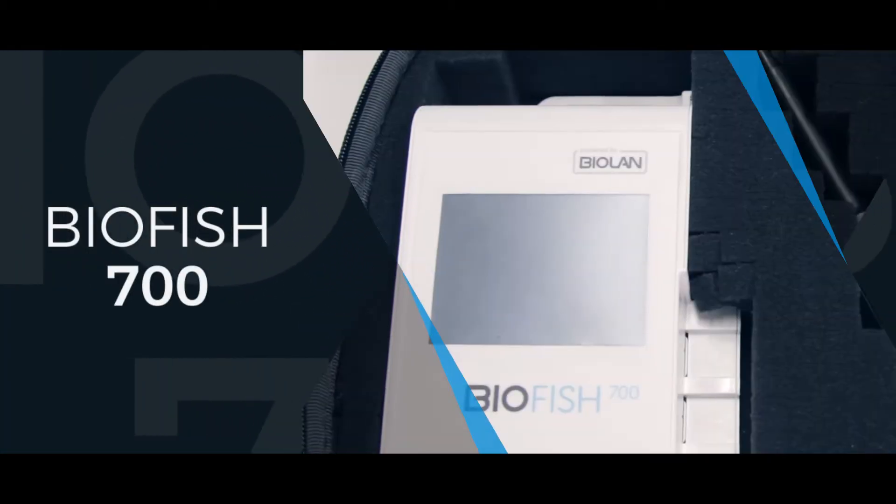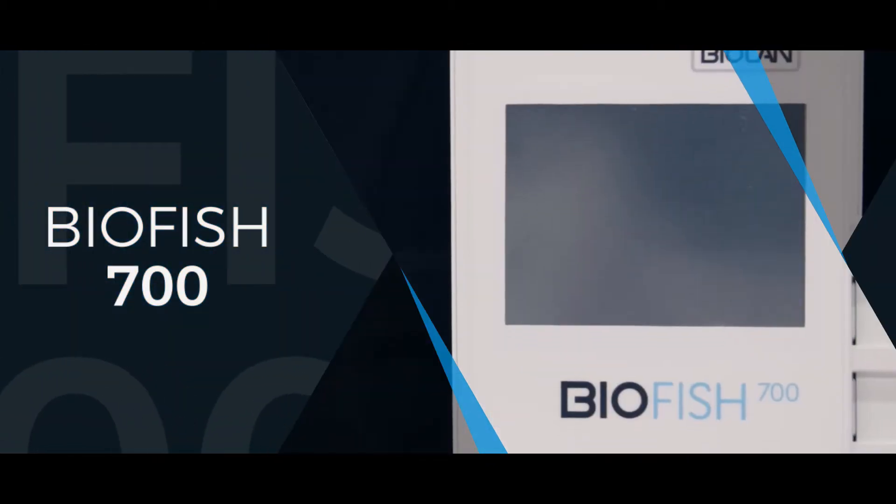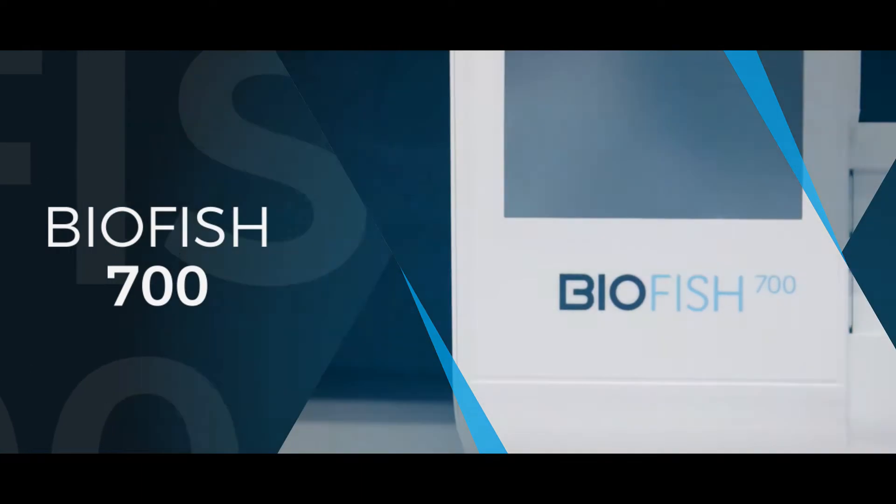BioFish 700: a portable, ready-to-use biosensor based on disposable strips for measuring the amount of sulfite in water tanks where the shrimp is treated.